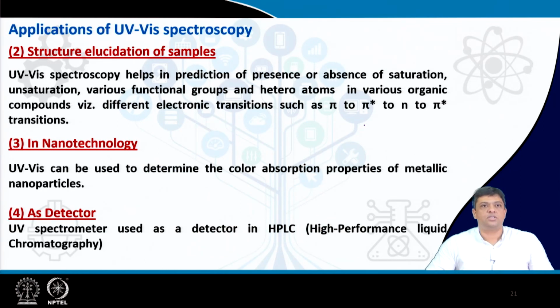Other applications of UV-Vis range from the field of nanotechnology to high performance liquid chromatography that can be used in polymers, rubbers, biophysics, nanofluids.